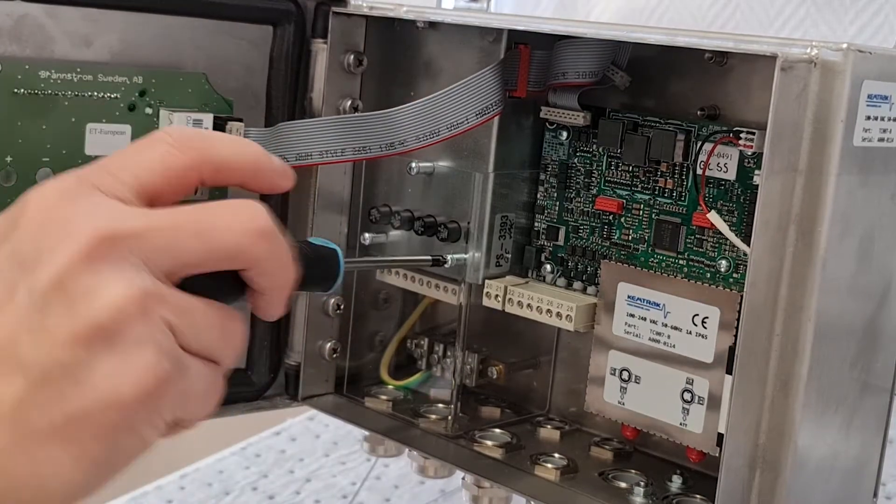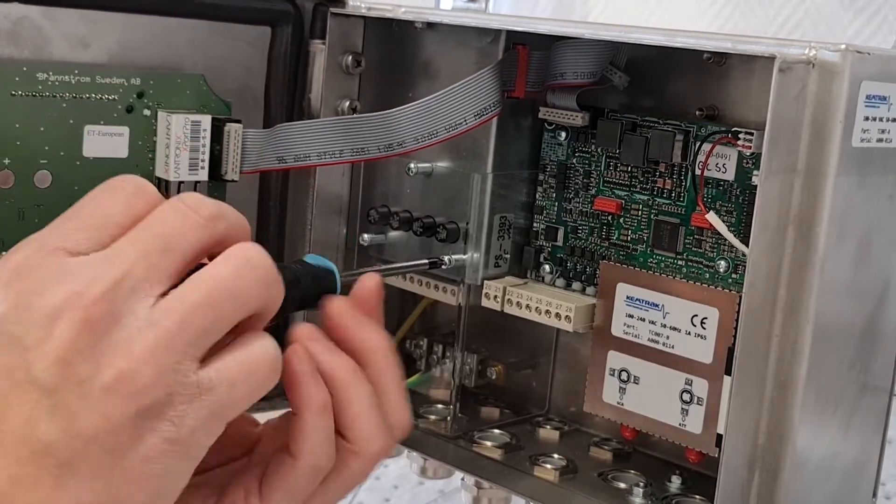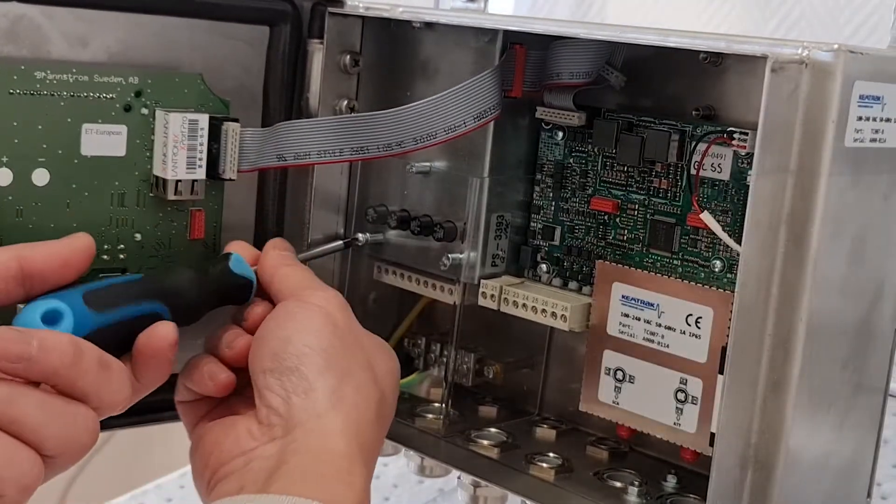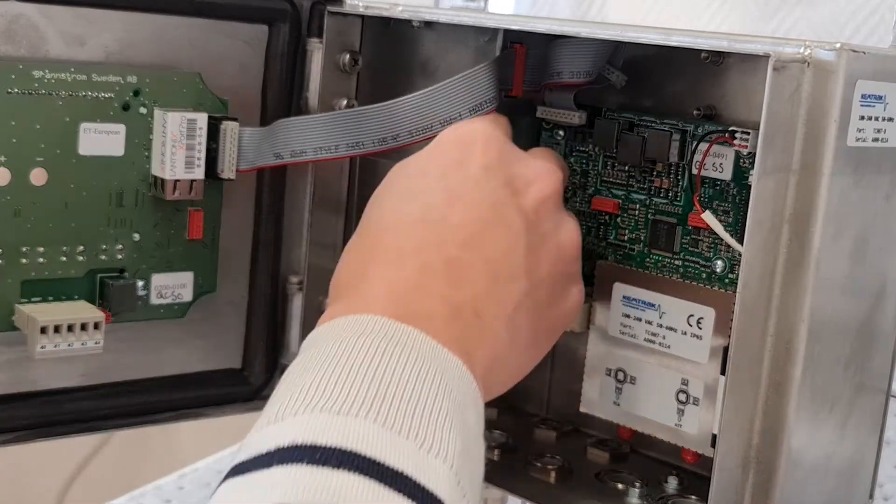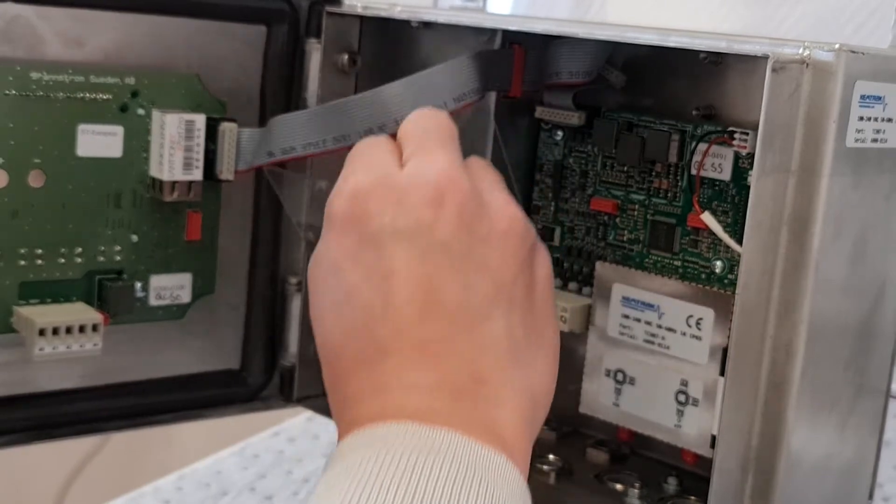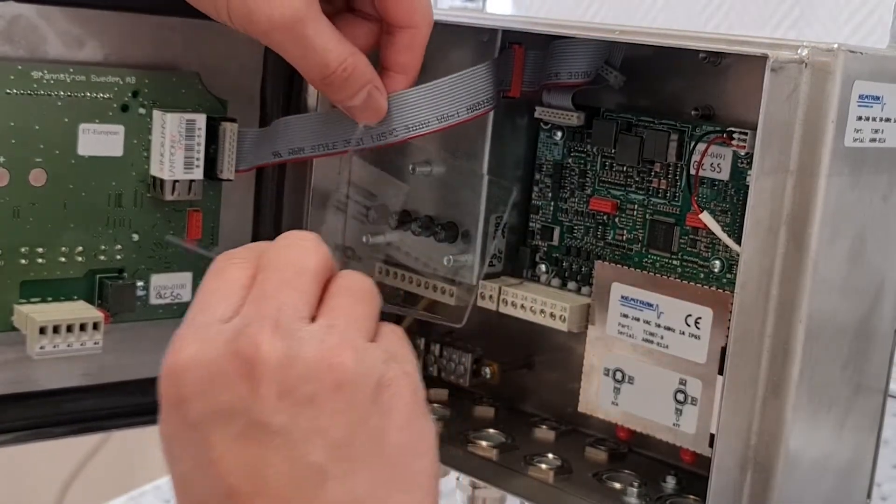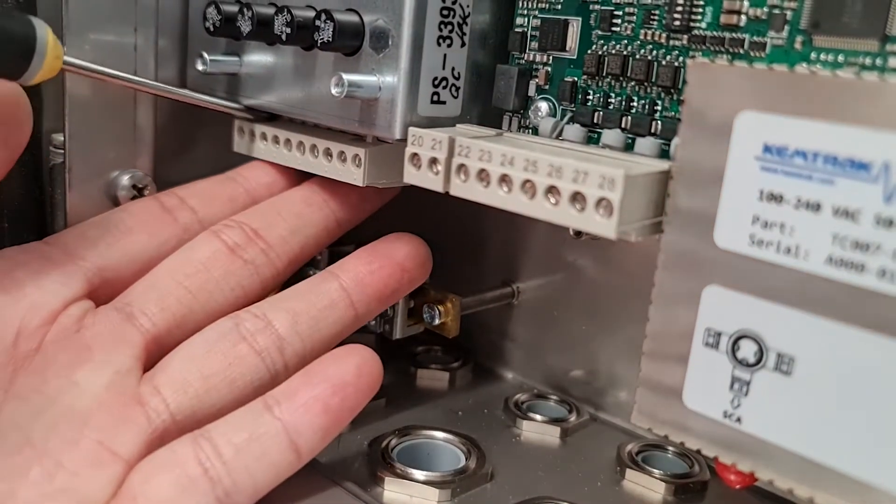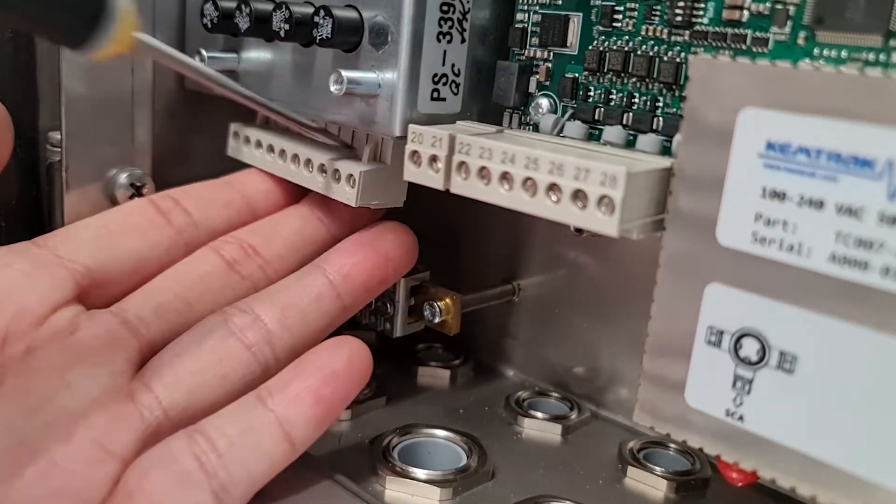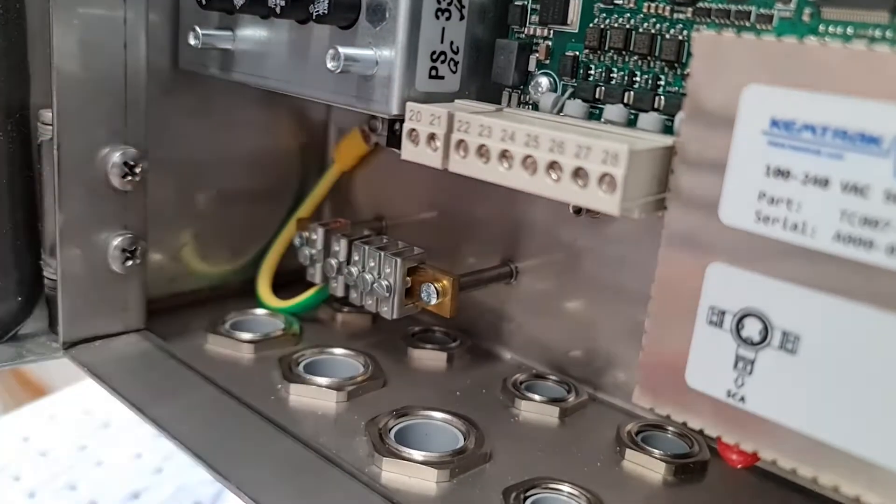The high voltage connections are protected by a clear cover that must first be removed. The power connector is located under the relay output connections. Remove these connectors first to gain access.